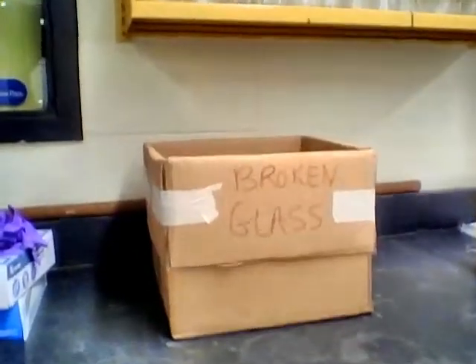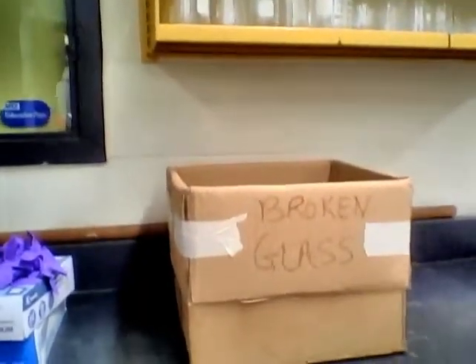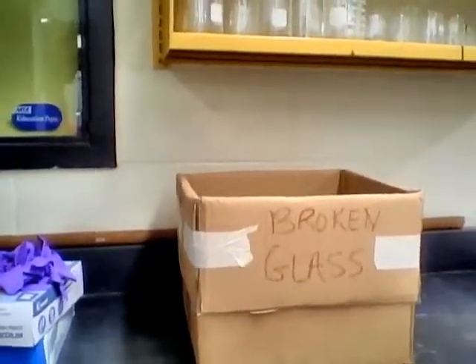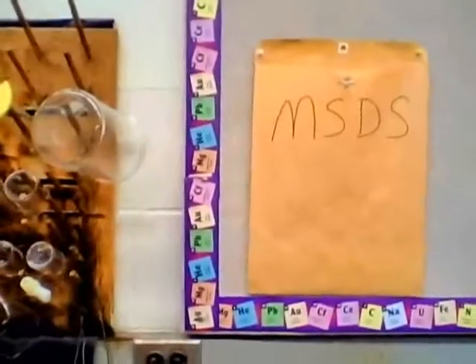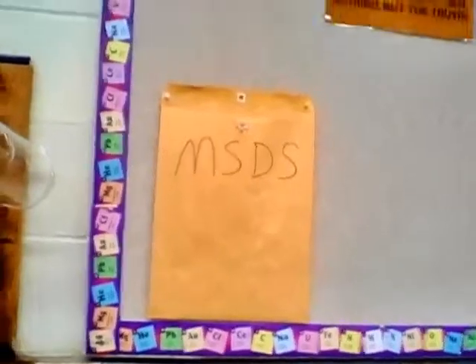Sorry if I'm moving too fast, we've got the safety goggles cabinet. We also usually have a stash of gloves over here on the right-hand side. And we also have the broken glass container, so I should be cleaning up broken glass if something is broken. I don't want you touching it and cutting yourself. Walking around the back of the room, we have our MSDS folder, and you can find the MSDS information online as well.